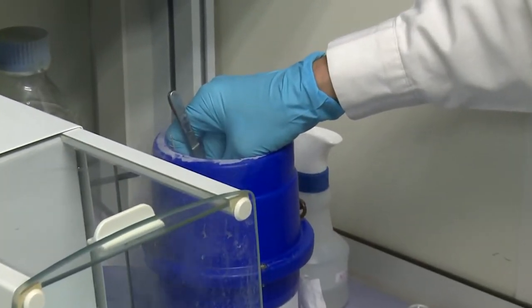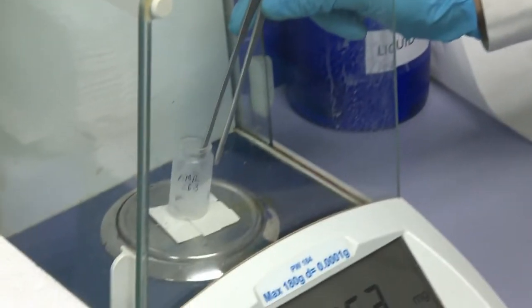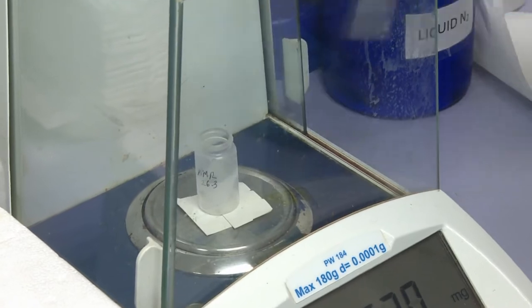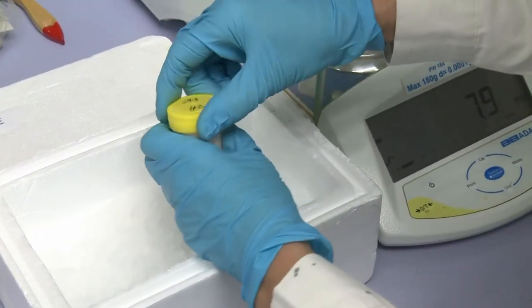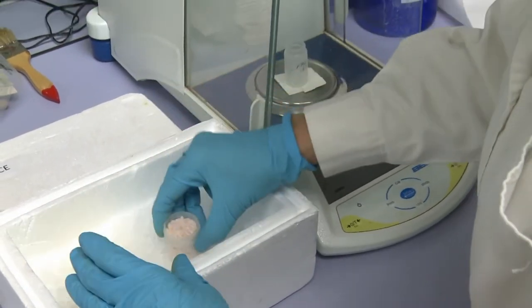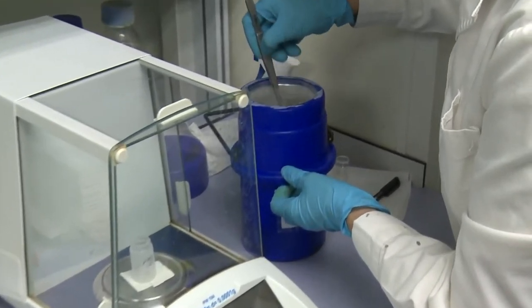Weigh 0.5 grams of frozen fruit powder in a 15 mL glass vial under liquid nitrogen conditions. Cool with liquid nitrogen both the vial in which the sample will be weighed and the spatulas that are needed.